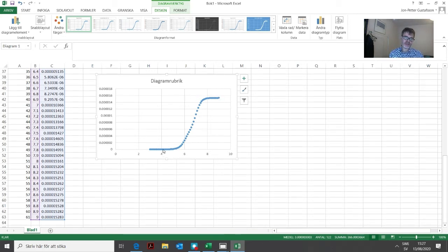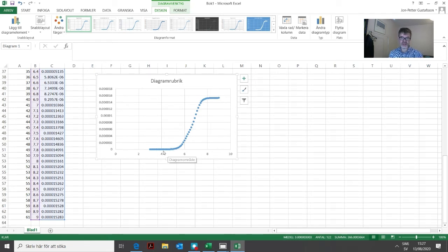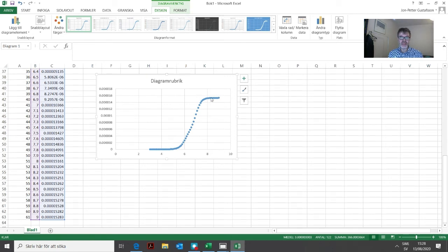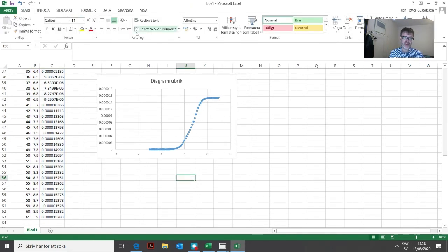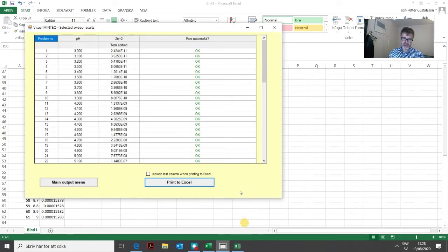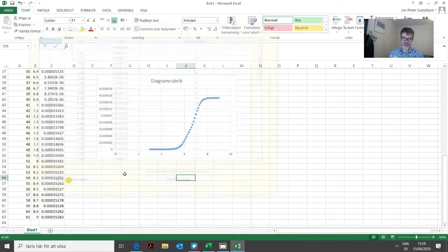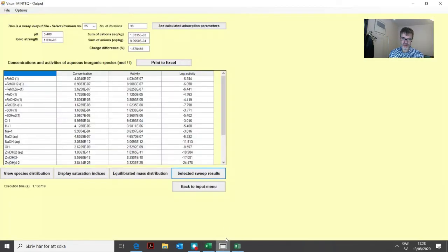We go from basically 0% zinc absorbed at low pH, and then up here at about pH 7, we're very close to 100% sorbed. That was one example of how you can use this sweep option.